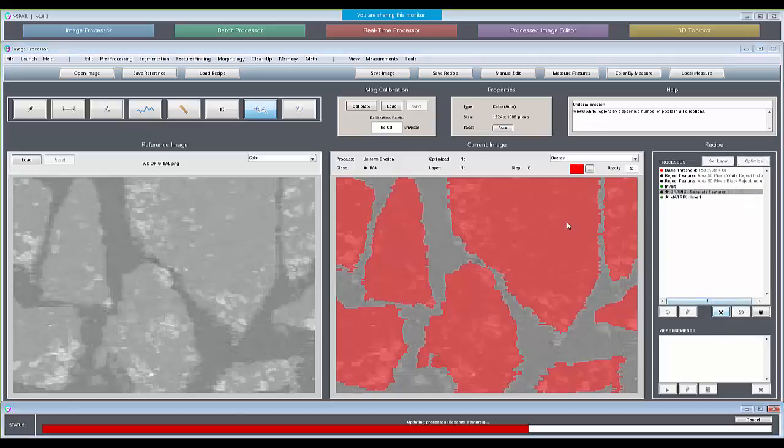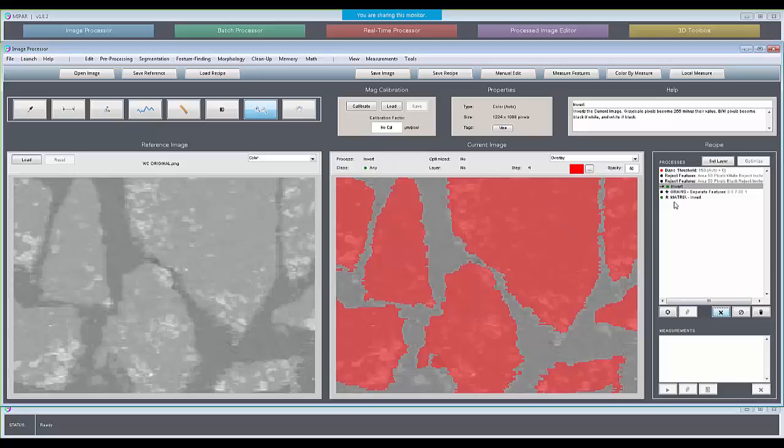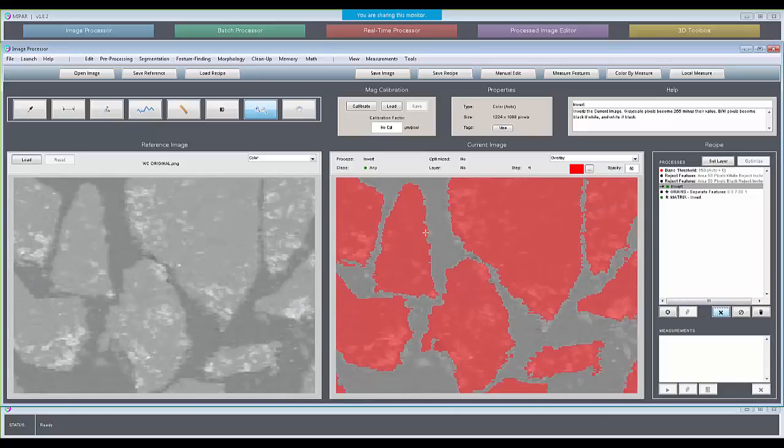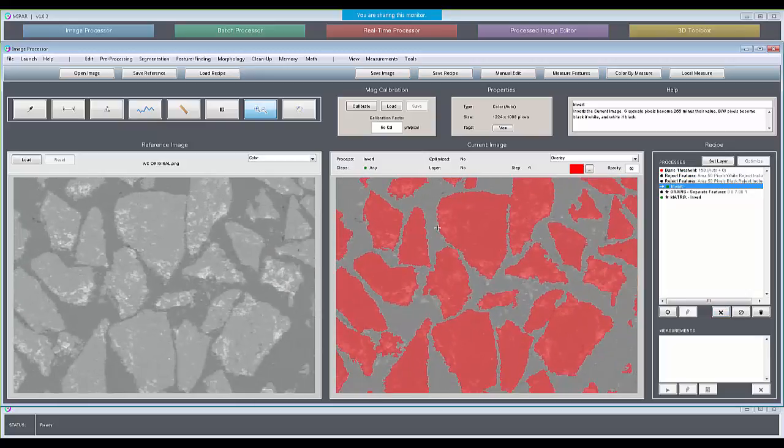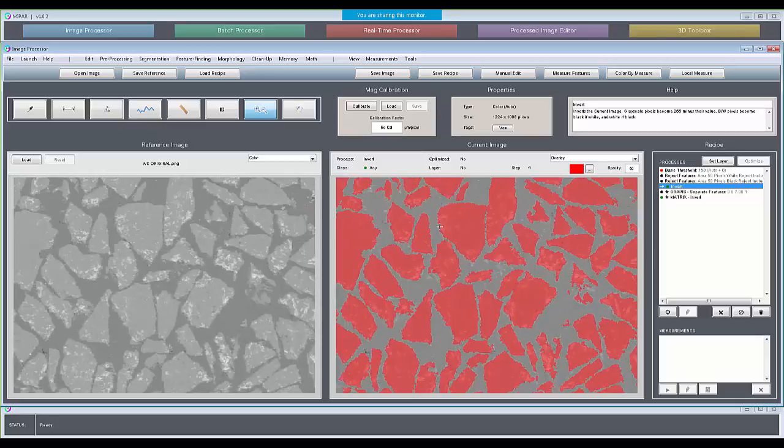So let me go back now and address Leslie's question a little bit better. She asked very insightfully, what about pre-processing the image so that you don't have any noise rejection? That is a very valid approach, and I can't say, in my opinion, that one is definitely better than the other. For some reason, my personal preference from my experience is to threshold as early on, as close to the original image as possible, and then clean up the thresholding noise.